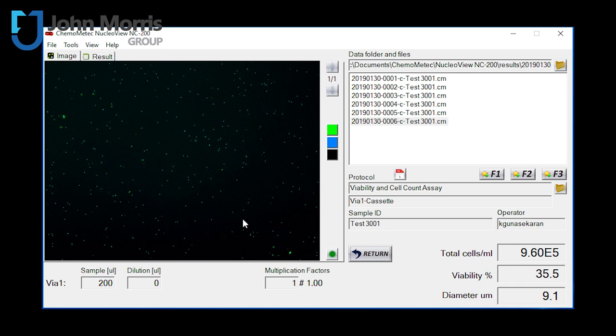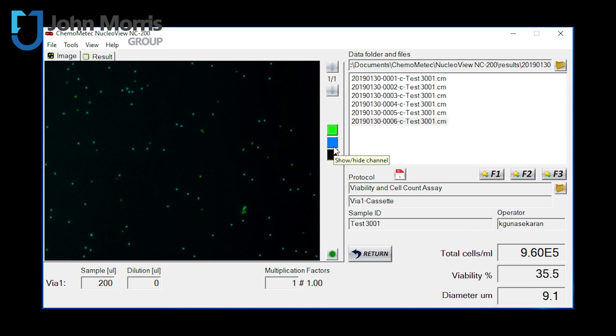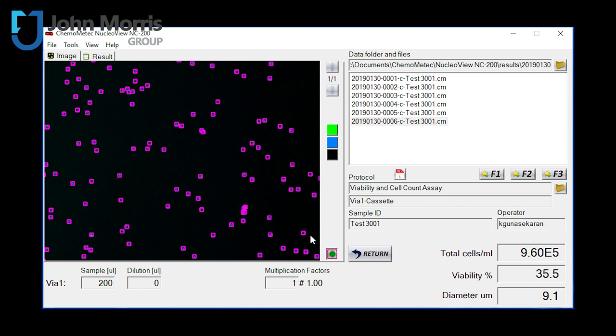And you can apply filters for what's viable. You can remove what's viable. You can remove what's non-viable. You can also have it draw squares around all of the cells that's actually counted. So you can see which cells it actually counted for you.